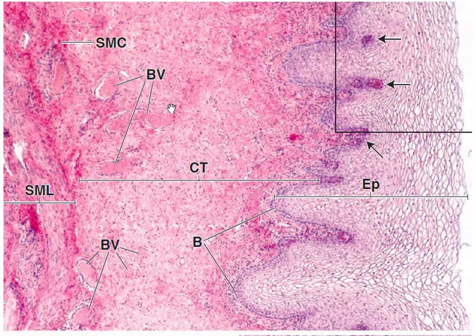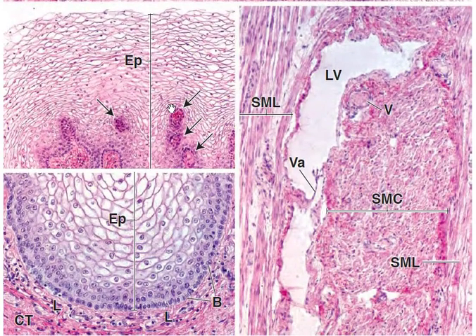All right, what else can we learn? So, in this picture right here, this is a higher magnification of the epithelium. The obliquely cut cross-section portions of the connective tissue papillae that appear as connective tissue islands in the epithelium are more clearly seen here, right there. In some instances they are outlined by the surrounding closely packed cells of the basal epithelial cell layer. Note again that the epithelial cells, even at the surface, still retain the nuclei, and there's no evidence of keratinization.